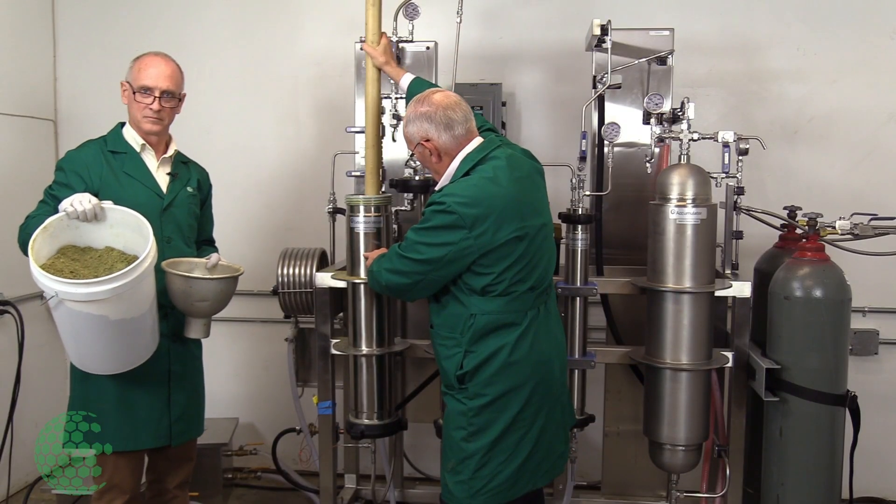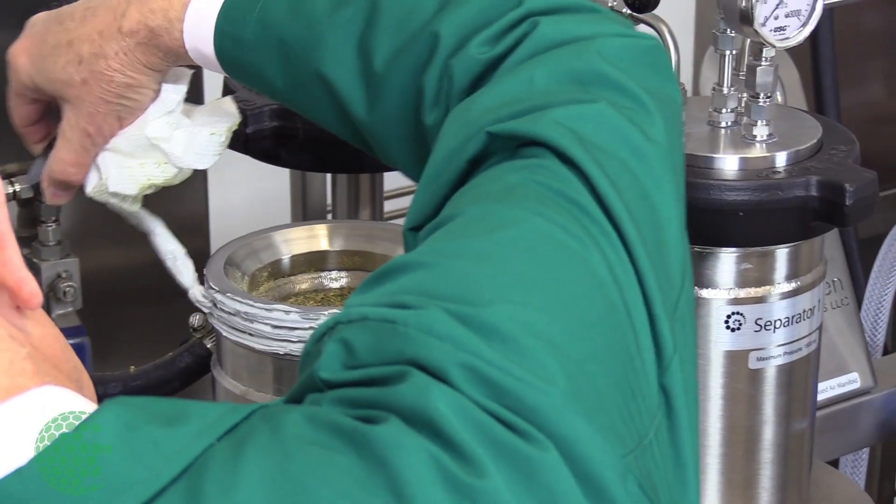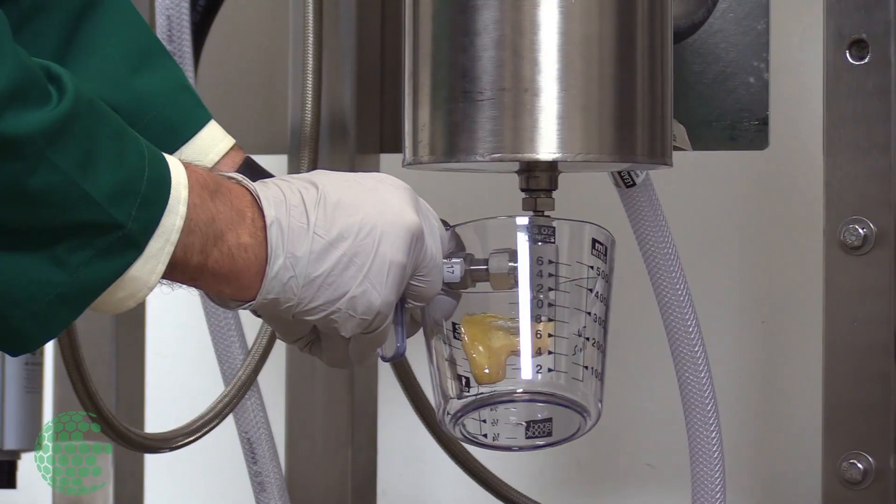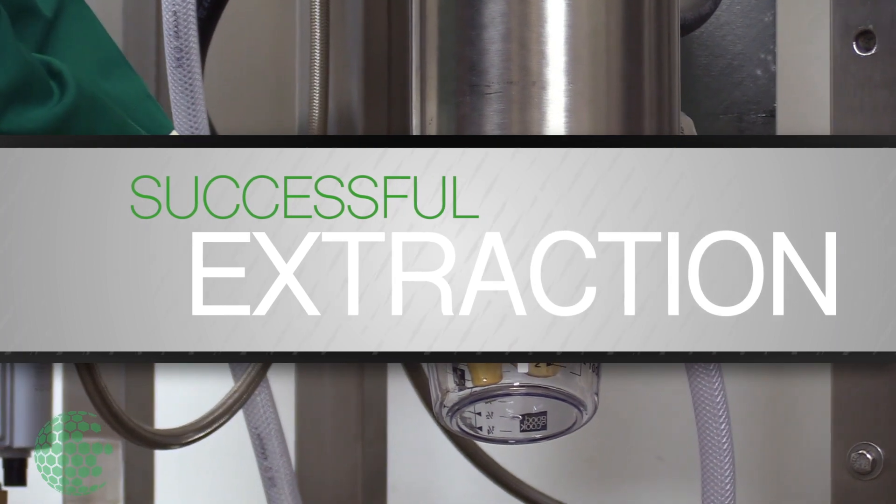So what Dr. McKay is going to do is collect the extract due to the pneumatic pressure surge that will be coming out of the separator, having the bonus DNC.